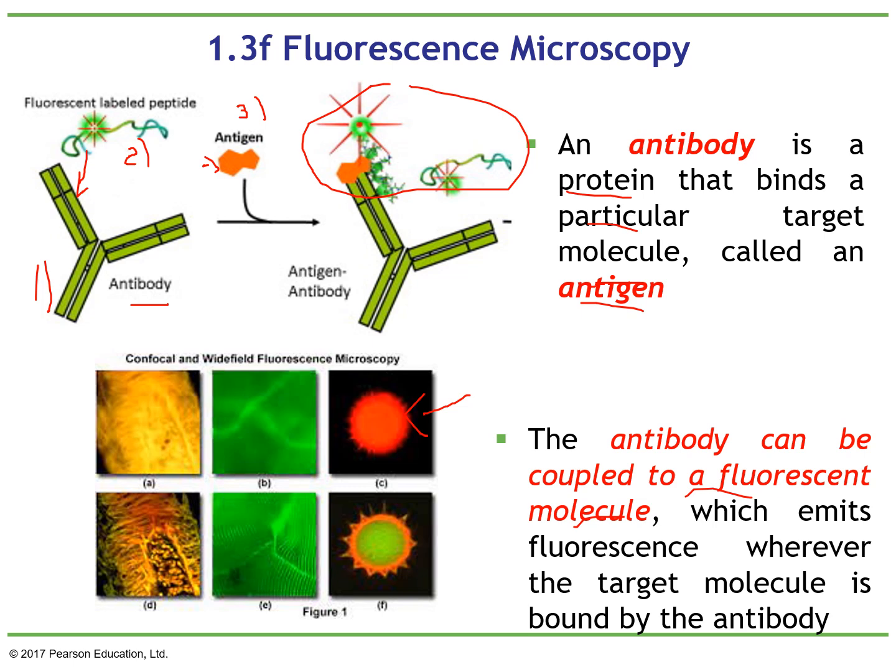Okay, so now that we have talked about fluorescent microscopy, this type of fluorescent microscopy is also divided into different fields and different types of microscopy, and I want you to observe these two types of pictures, the one here and the one here. If you compare the one here to the one here, they are the same, but one of them has better resolution, the other one looks blurry. The same thing happens here, and specifically here, this looks like it has a higher resolution, much better.